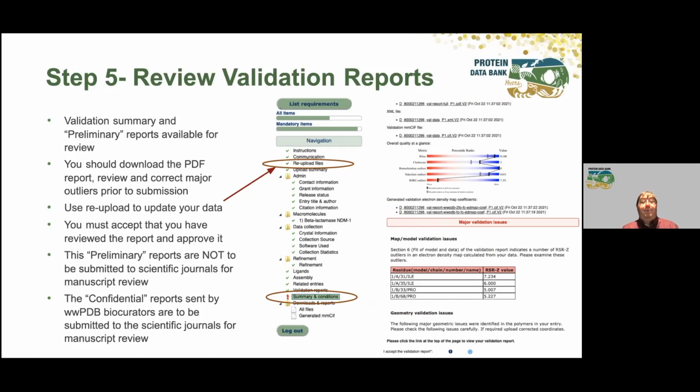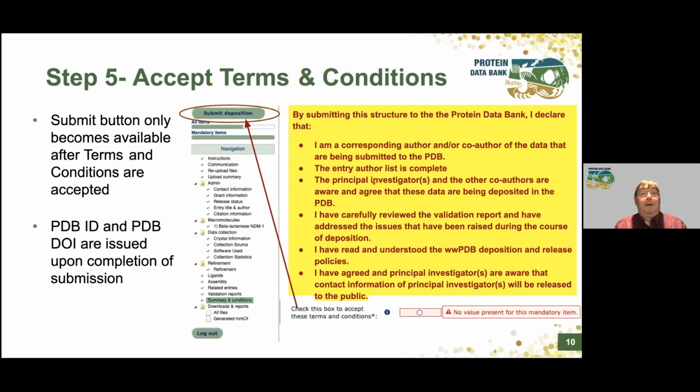During deposition, you'll get a preliminary validation report, and that's not to be submitted to the journals. We'll give you a confidential one during the actual review after we process the data and send it back to you. In the end, the last thing to do would be signing off on the terms and conditions.